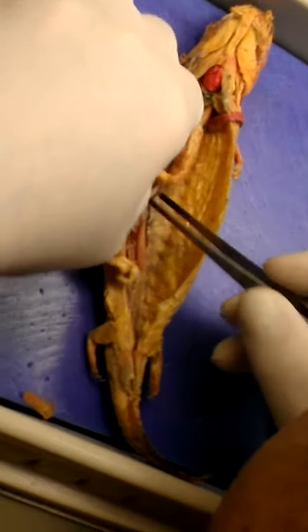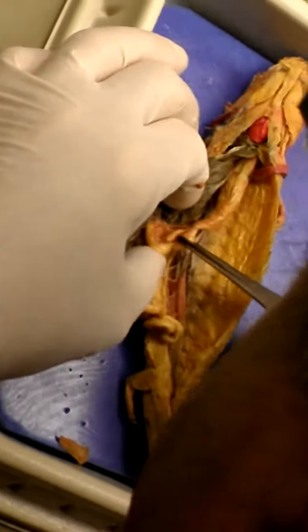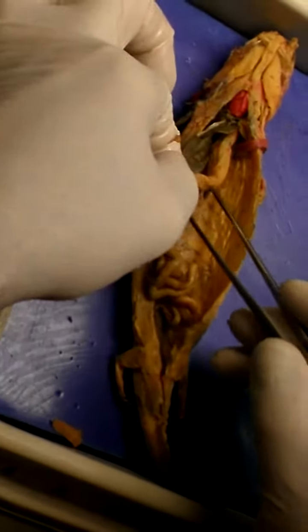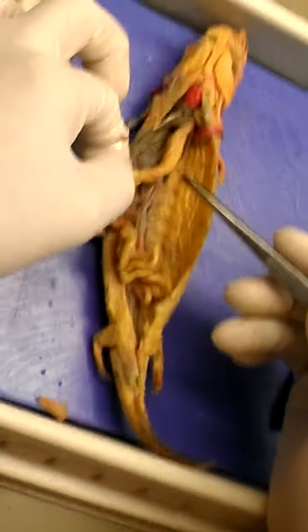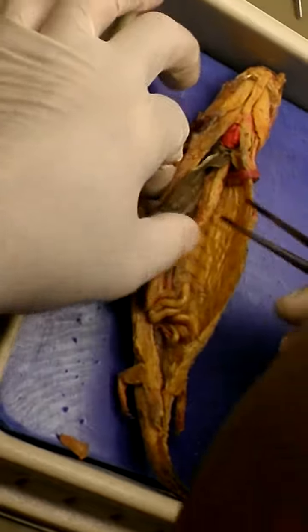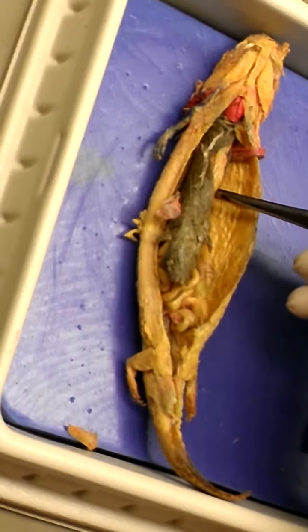If I follow the gut tube up, what I find is that I have a stomach here. Down here, embedded in the gut tube, this is glandular tissue right here. That glandular tissue there has to be pancreas, can't be anything else. It's embedded inside of the mesenteries next to the gut. Up here, I have a structure that is the color of the liver. There's only one of them. That has to be the spleen.